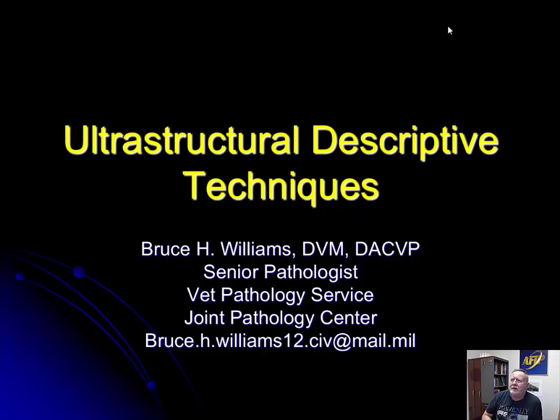I like to say that it's like having a super duper objective on your scope. We have all the regular objectives, including oil, which gives us a 1000x magnification. But imagine if you could spin it one more time and go to 10,000 or to 50,000. The same cells are there, the same organelles are there. We just get to see them up close.